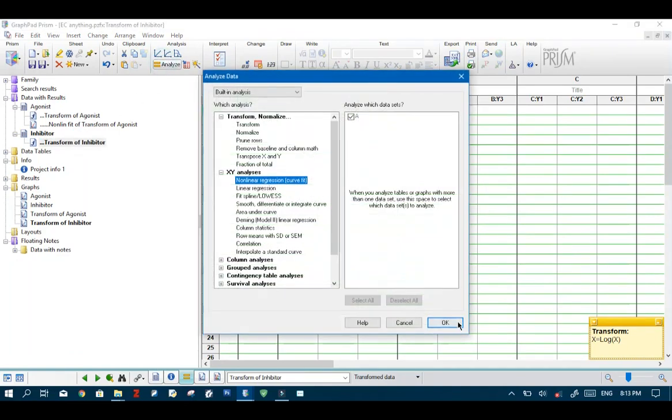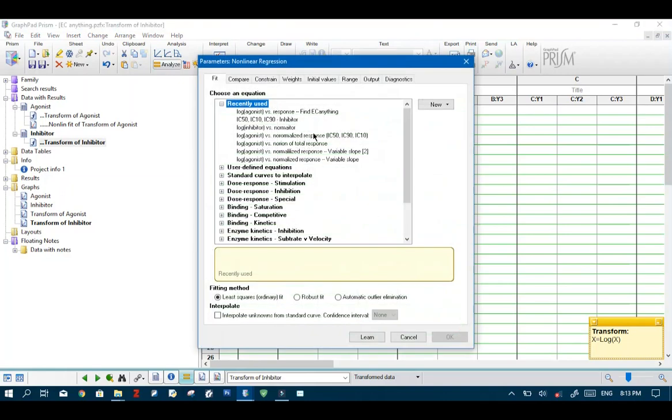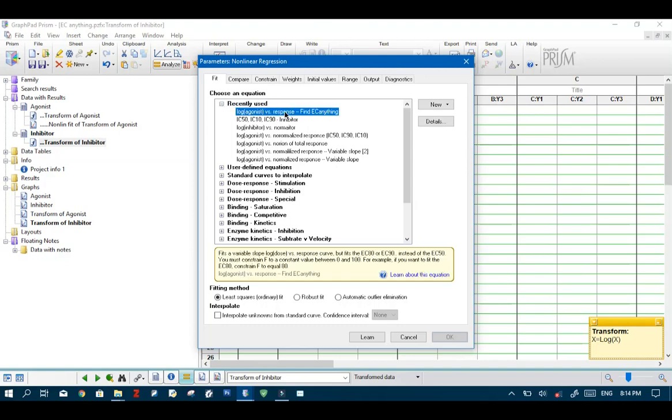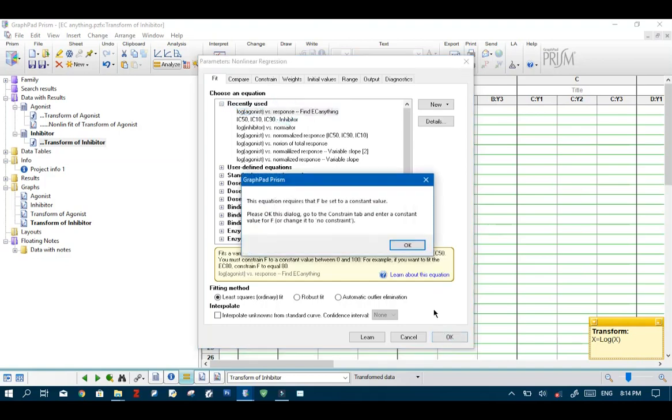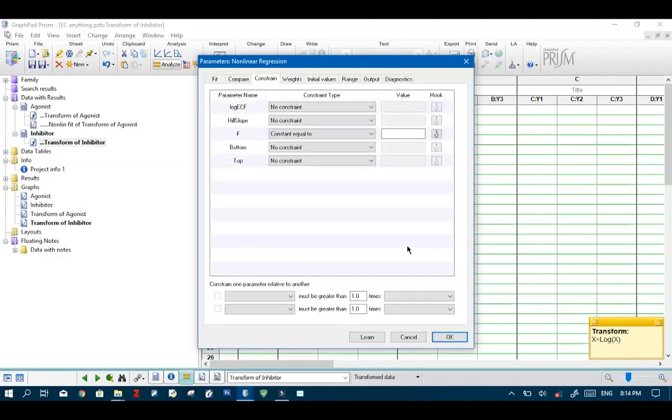Now we get the transformed values. Make sure it's selected again. Hit analyze. Go to nonlinear regression. And then because we've already used this formula before we find it under recently used. So just select it and hit OK. Now hit OK. And we want to enter the F constant value.